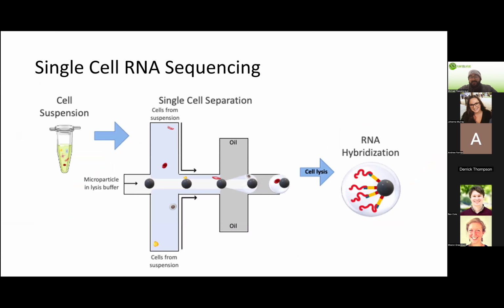We can actually take this further. We can then do single cell sequencing. So what we do is we have a bunch of cells in a buffer. They get mixed so that each cell is associated with approximately one bead. Once these fluids are combined, you then add a partitioning oil to separate out the droplets. So the oil surrounds the water that contains the cell and the bead.